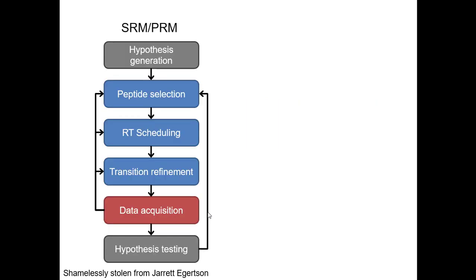Okay, the biggest reason to do DIA, and I think the reason why people are interested here in this room as well as in the community at large, is that SRMs are really hard to do. SRMs and PRMs are hard to do correctly.